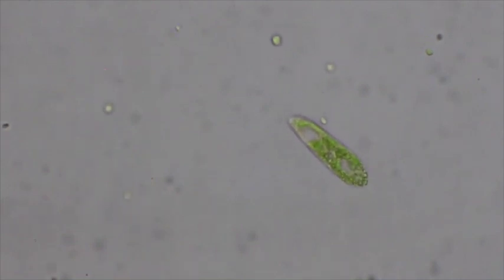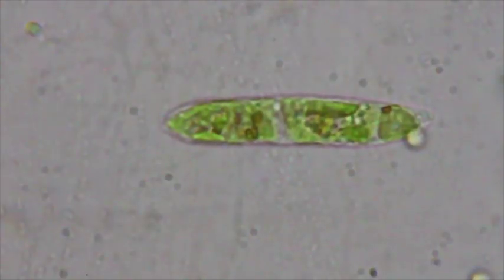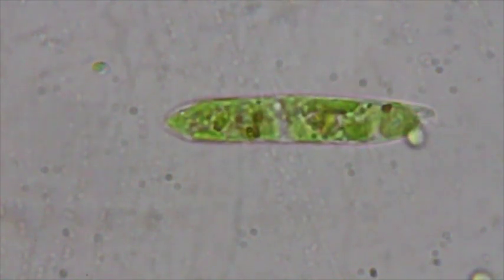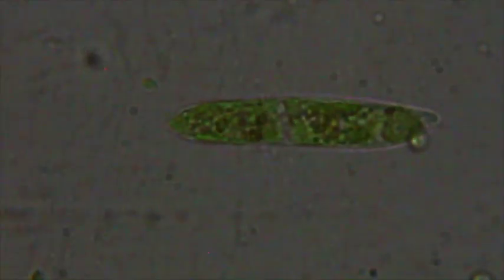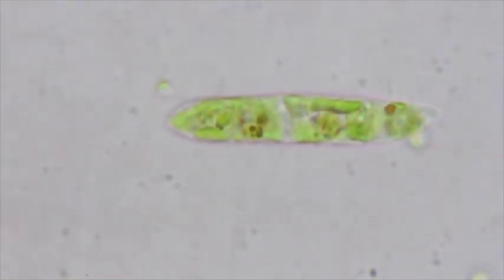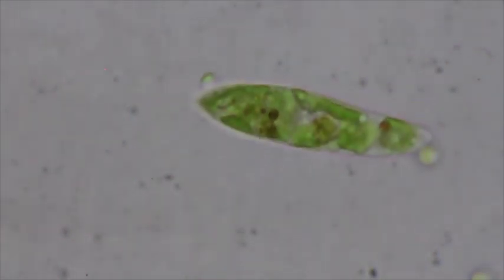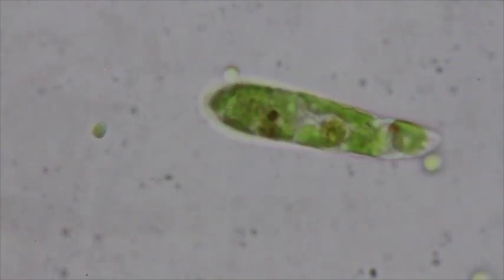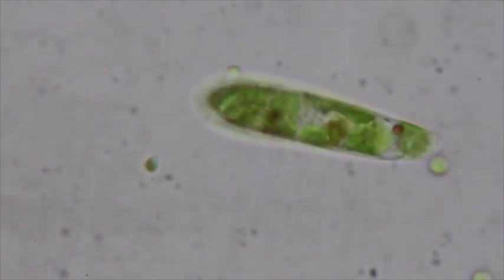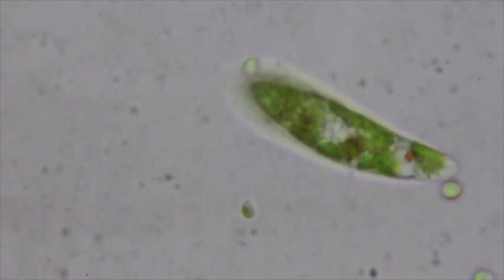I'll center it, and we're actually going to go under oil immersion. There is our euglena under 100X magnification. You can see a lot on it — you can actually see that flagellum there. I'm going to change the lighting to get more resolution. You can see a little red spot down on the right side, which is the stigma. You can see the chloroplasts everywhere. If I focus it just right, you can actually see the flagellum wiggling around down near the stigma.